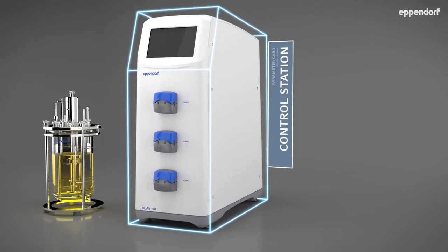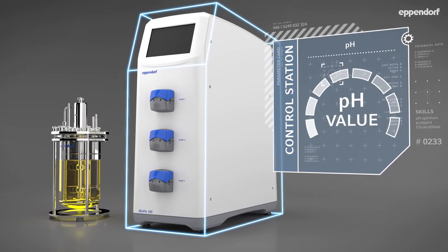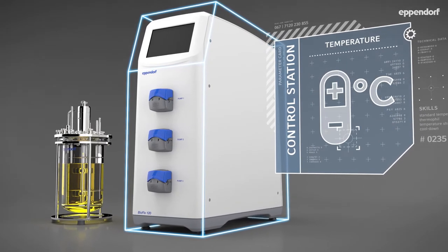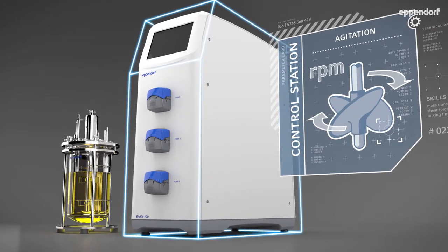Bioprocess systems combine an external cabinet for advanced process control of parameters, including pH, dissolved oxygen, temperature and agitation, with an enclosed vessel to maintain sterility.